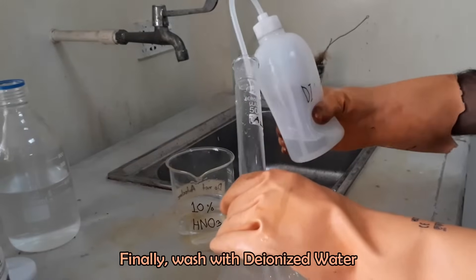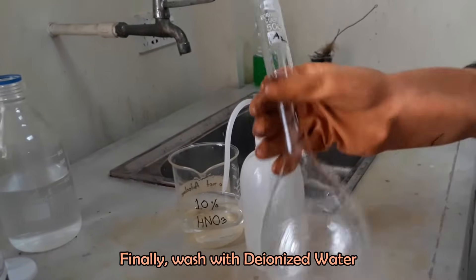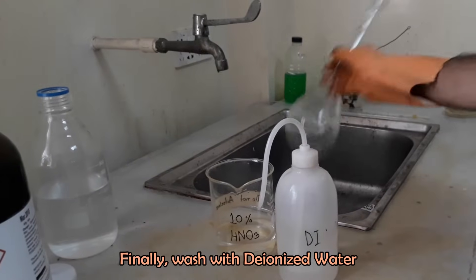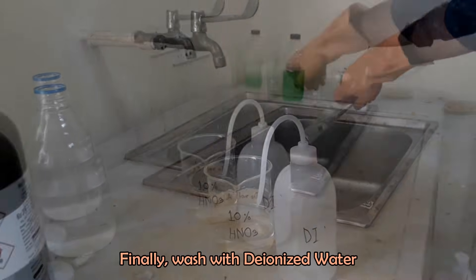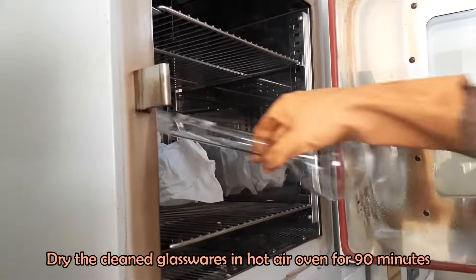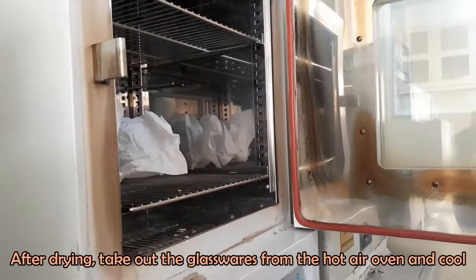Finally, rinse the flask thoroughly with deionized water. Then dry the flask in a hot air oven for 90 minutes. In this way, clean every glassware before use.